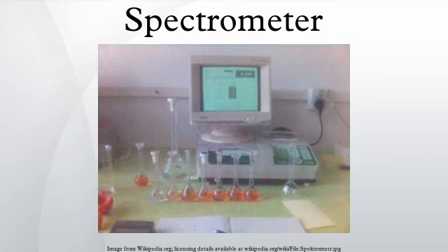In modern spectrographs in the UV, visible, and near-IR spectral ranges, the spectrum is generally given in the form of photon number per unit wavelength, wave number, frequency, or energy, with the units indicated by the abscissa. In the mid to far IR, spectra are typically expressed in units of watts per unit wavelength or wave number. In many cases, the spectrum is displayed with the units left implied.